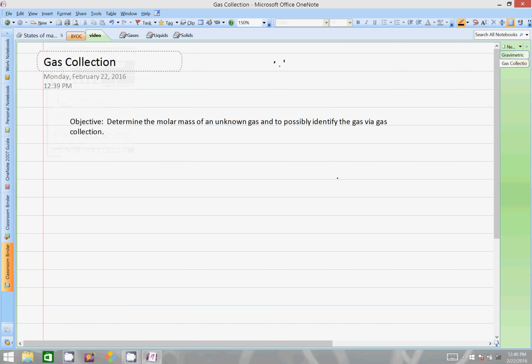Good afternoon, this is Schweitzer, and this is a little preliminary video that's going to cover not only a little bit about how our lab is going to run, but also some background information on the actual lab concept or lab topic. So, overall objective here is to determine the molar mass of an unknown gas and to possibly identify the gas via gas collection.